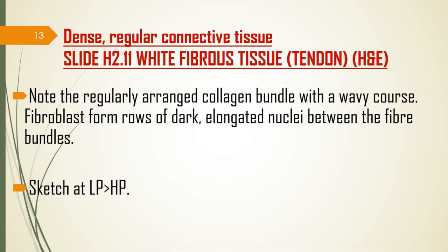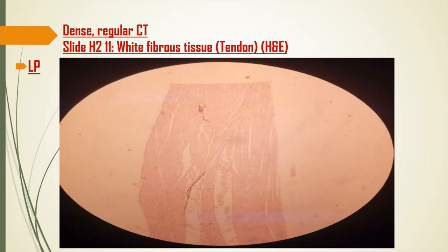Dense regular connective tissue is seen in a tendon. Note the regularly arranged collagen bundles with a wavy course. Fibroblasts form rows of dark elongated nuclei between the fiber bundles. Sketch this at both low and high power. At low power in the tendon, the fibers are arranged in a very regular shape, and you can see dots between them — those are fibroblasts.